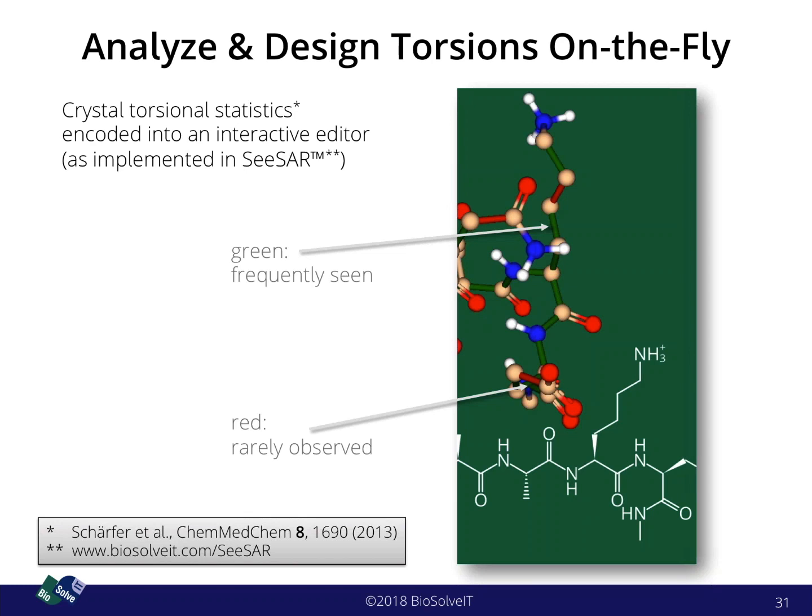So to give you a glimpse of what we did with this before, here's a little peek into the 3D world here. A few years ago, in collaboration with Hamburg University and Roche in Basel in Switzerland, there was a statistics-driven notation or coloring system for rotatable bonds generated.